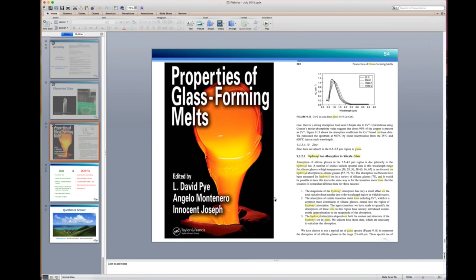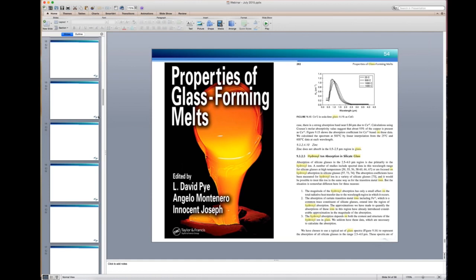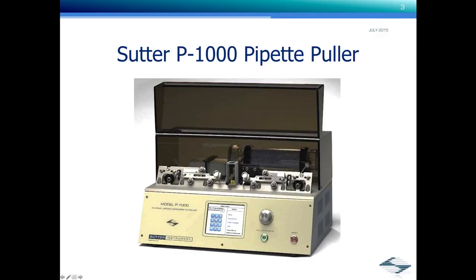If that's happening, it's possible that the right and left puller bars are either bent or the panels are somewhat offset. These puller bars here are aligned. They're straightened, and they're straight within about 12.5 microns from front to back, and this puller bar has to be perfectly aligned with this puller bar. So if it's offset, you end up pulling the glass kind of like this.